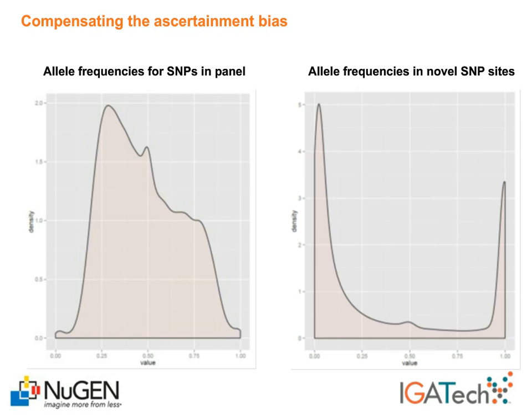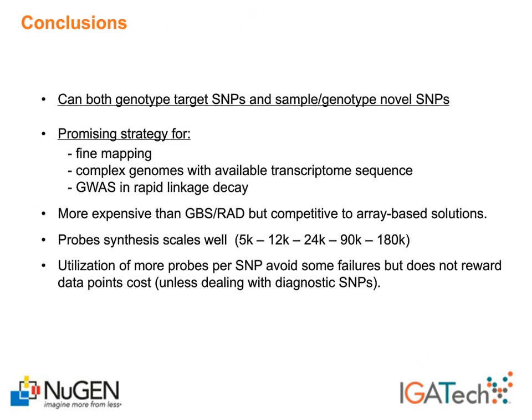So to conclude, this system, as we adopted it, can both genotype target SNP sites and also sample and genotype novel diversity.